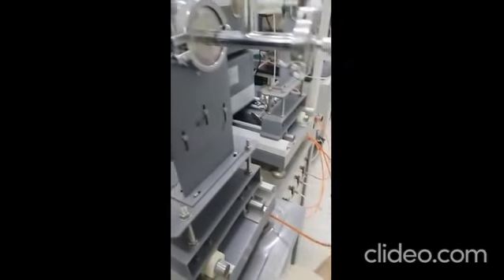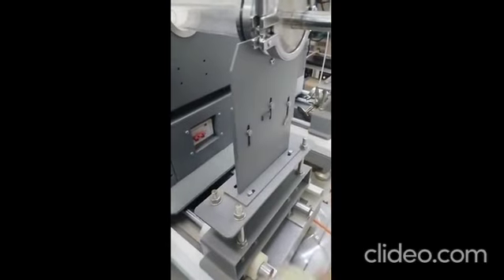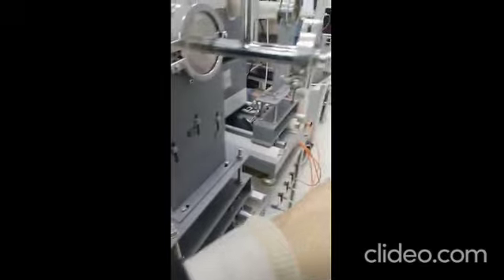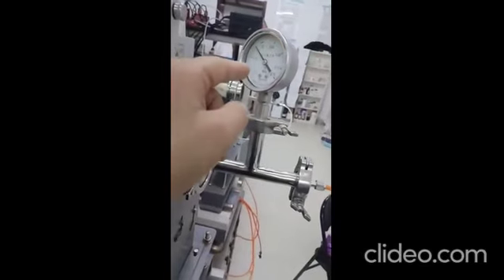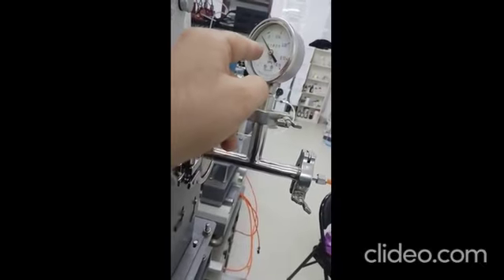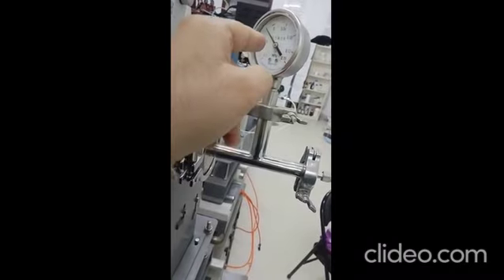And this one, I think Ar. Yeah, Ar is here. So how much is the pressure here? Megapascal is 0.02, right?